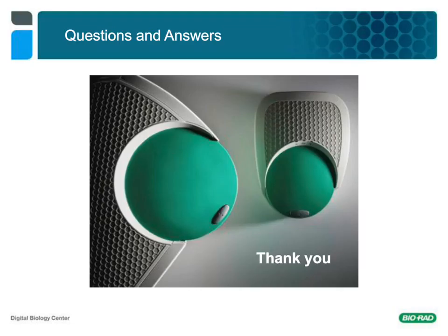Thank you. I think we've got time for a few more questions that are coming in now. So our next one is, for the KRAS multiplex assay, how can we validate for the individual assays within the multiplex? Again, as I mentioned in the data presentation, we have the duplex or the singleplex assays. The individual mutations are wet lab, wet bench validated already and purchasable on the Bio-Rad website, and they will give you the exact same numbers.